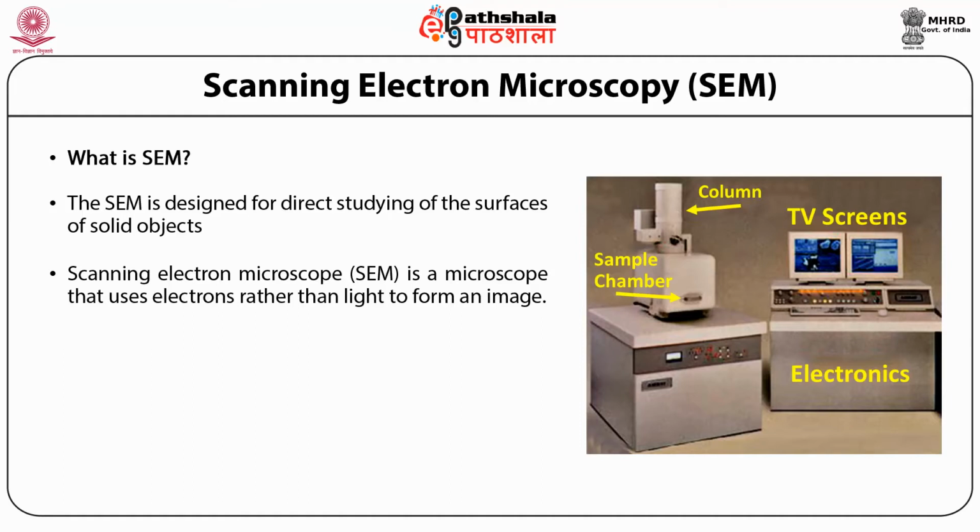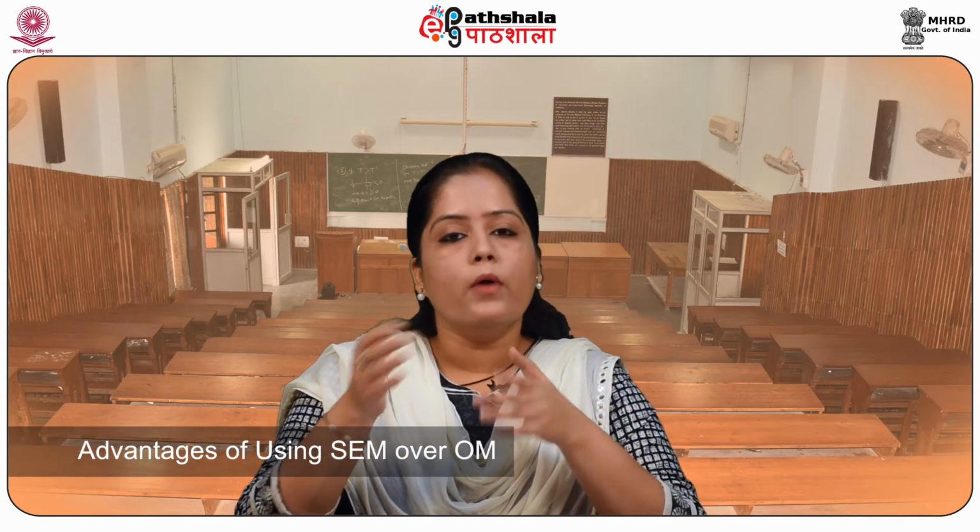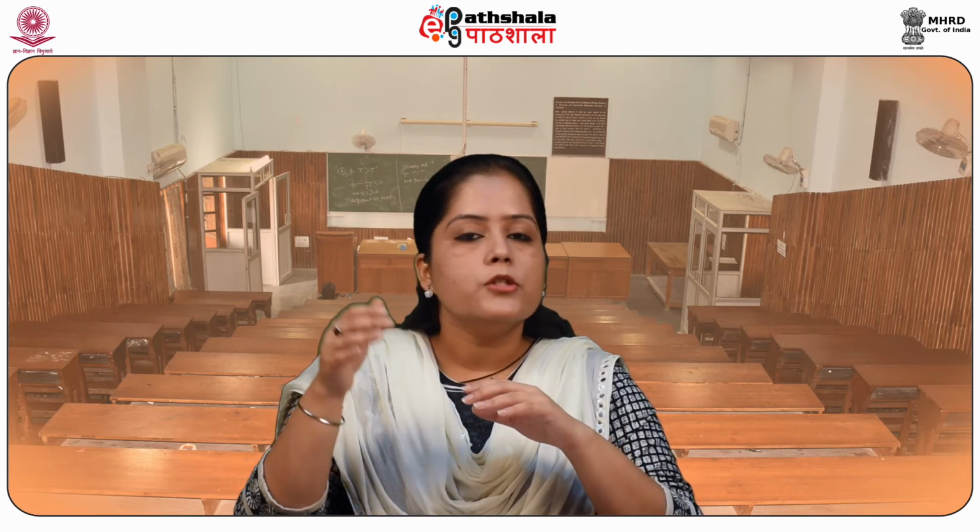As we know, there are enormous advantages to using the SEM instead of OM. So let us discuss the advantages of using SEM over OM. Magnification, depth of field, resolution. For OM it is 4x to 1000x, that is 15.5 micron to 0.19 micron, approximately 0.2 microns. For SEM, 10x to 3 into 10 to the power 6x, 4 mm to 0.4 microns and 1 to 10 nanometers.